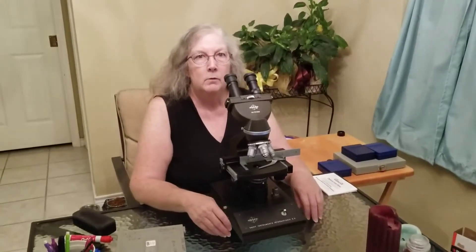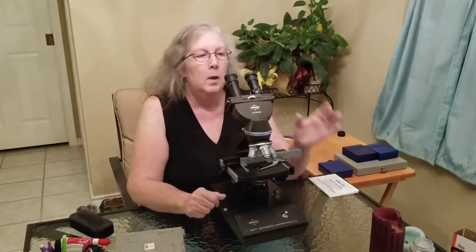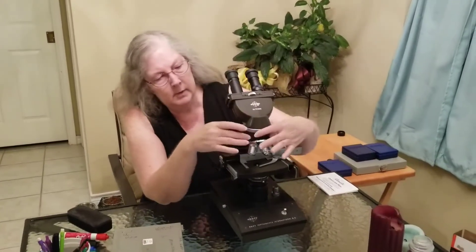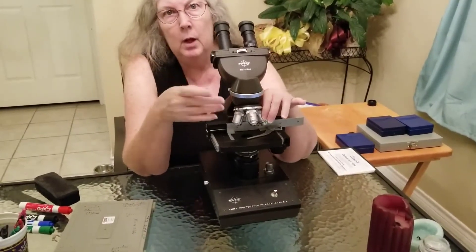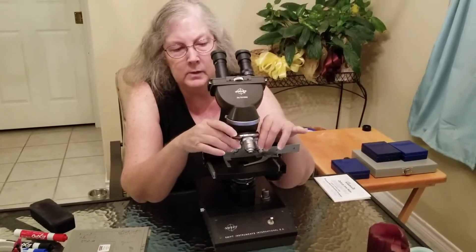We're going to talk about the microscope and how to use it. First, you have to know the parts of it. Up here, the eyepieces are referred to as your ocular lenses. This is your nosepiece, which is holding the objective lenses. Depending on the microscope you have, there may be three — mine has four objective lenses.